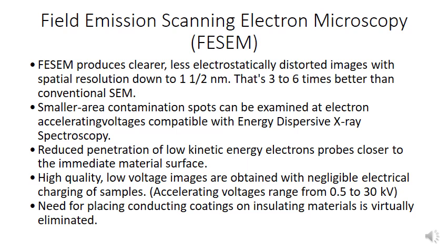And after that, FSEM also produces high quality images, and low voltage images are obtained with negligible electrical charging of samples. So basically, FSEM has been modified to allow low voltage energy. Okay, so we can see that the charging problem is reduced when you use FSEM. And the need to place conducting coatings on insulating materials is virtually eliminated for FSEM.